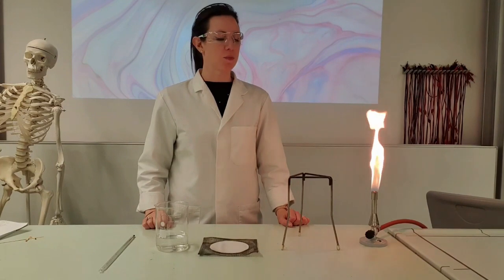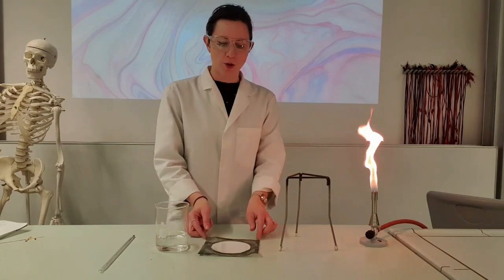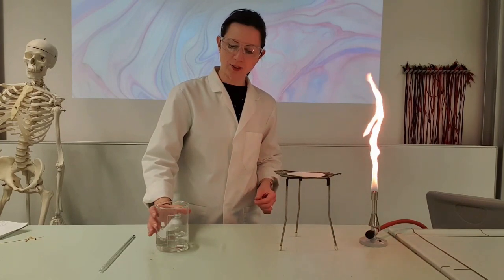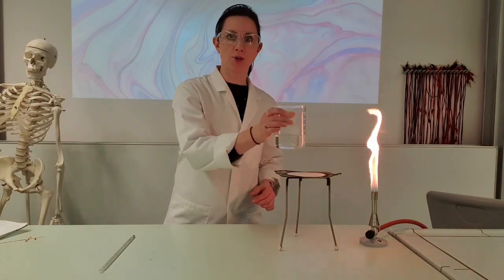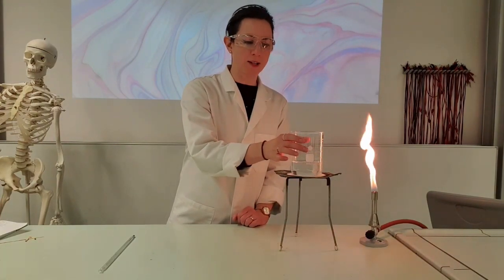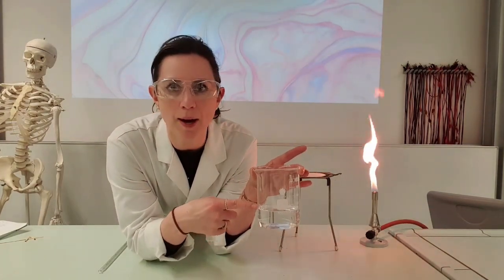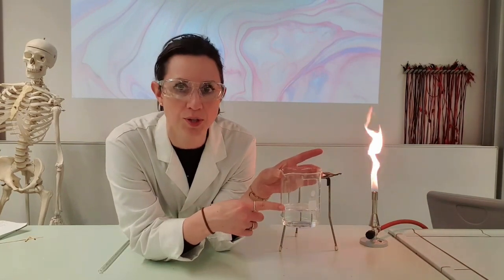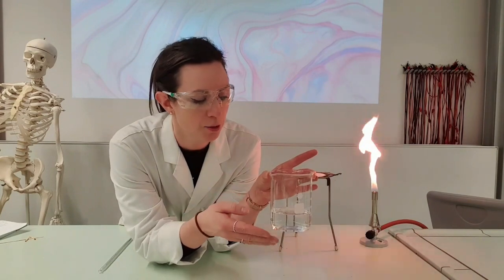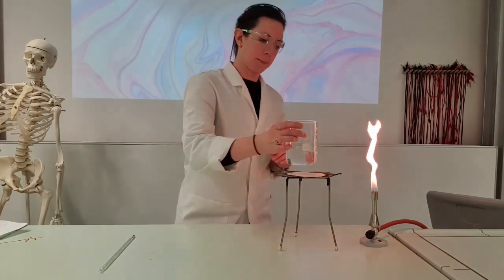Setting up the water bath is very simple. You take your tripod, you put a gauze on top of your tripod, and the beaker that will make the water bath on top of the gauze. Now just take note before I get started of the amount of water that I've actually put in the beaker. It's only about a quarter of a beaker's worth of water, because if you're going to add something else into the beaker, the water volume will rise and we don't want it to overflow because that will create some problems.